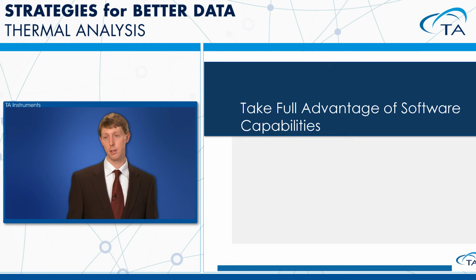So we've talked about data. We've talked about not overanalyzing. We've talked about a majority of the structural correlations that go with that. Now, the next section here is really just looking at a few features that exist in the software that many people aren't commonly aware of, but can be powerful when you're trying to collect information and generate reports and so forth.